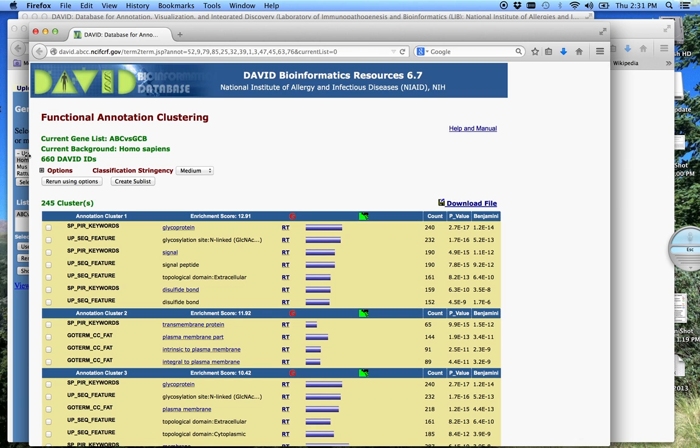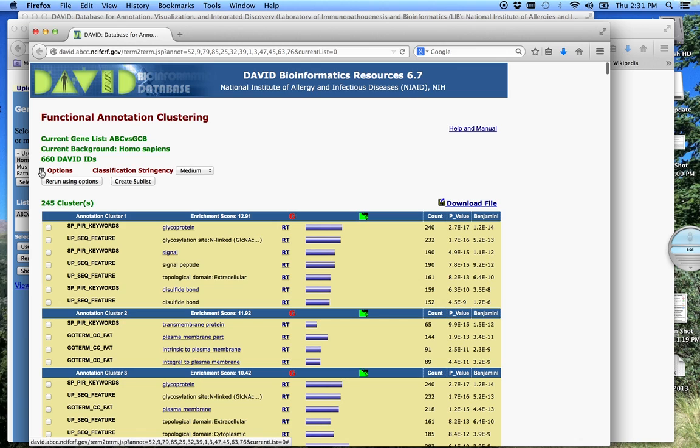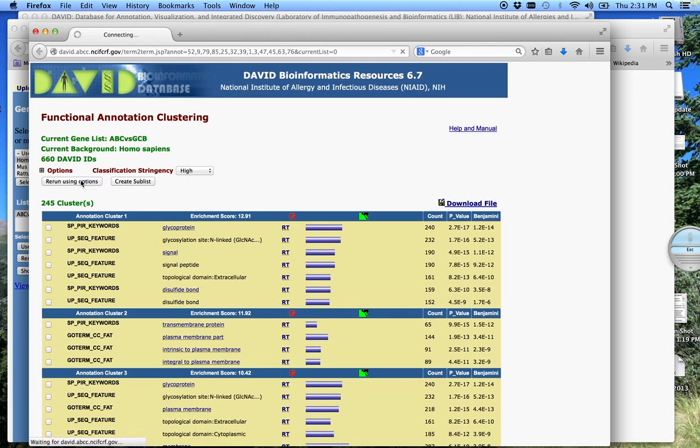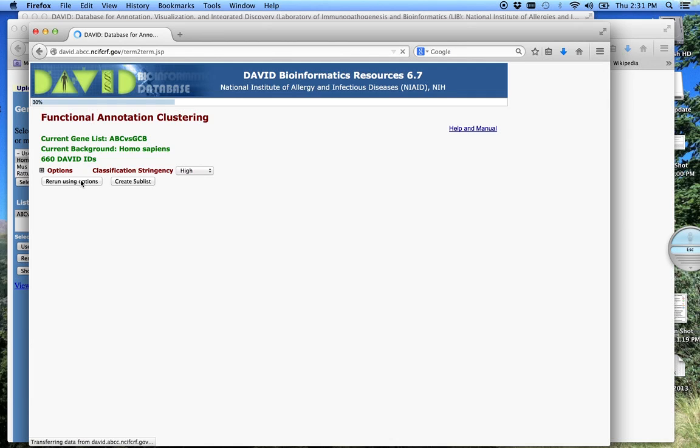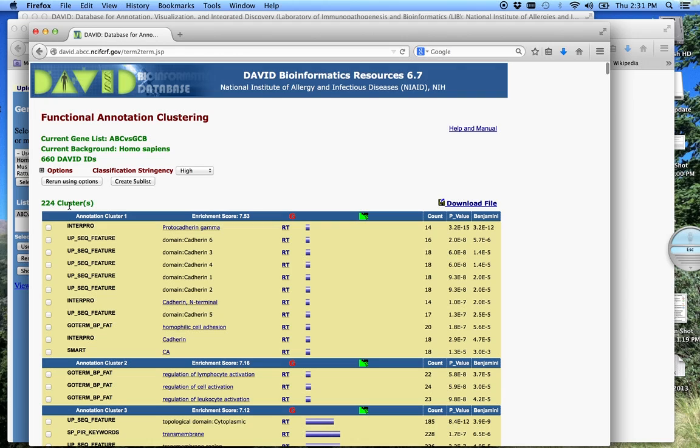Again, you can run this with any options you want. We can add false discovery rates, fold change. We can play with the terms as far as how many terms do I want in common for it to be considered a cluster. Usually right now we have 245 clusters, annotation clusters. I usually, when I'm analyzing data, I like to go a little higher than medium. So I'm going to go high, rerun using options. And now we have 224, because we were more stringent, given on the top.